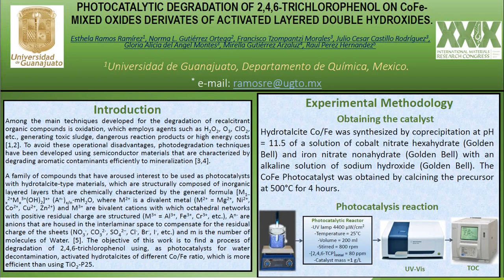This paper presents the results of the application of thermally activated cobalt-iron hydroxide as photocatalysts. Hydroxides were obtained by co-precipitation with cobalt-iron ratios 1, 2, 3, and 4. Hydroxides were characterized by X-ray diffraction, infrared spectroscopy, thermal analysis, nitrogen sorption, and scanning electron microscopy with energy-dispersive X-ray spectroscopy.